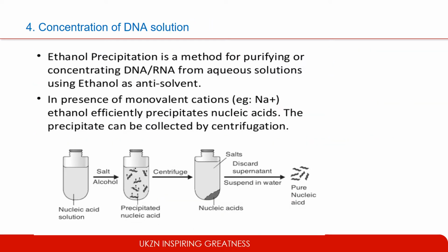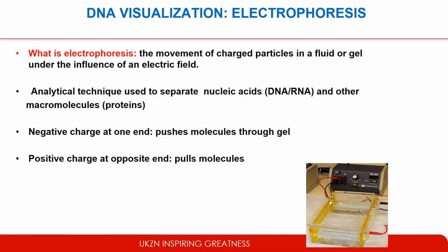Once you have purified your DNA from the cells, the next step is to precipitate it or wash it. And one of the most common chemicals that is used for washing is ethanol. Isopropanol is also acceptable. Although these chemicals wash the DNA, they do not degrade or interfere with the DNA. So the final step is concentration of the DNA. So once the DNA has been concentrated, it is now ready for downstream application, be it sequencing or PCR.